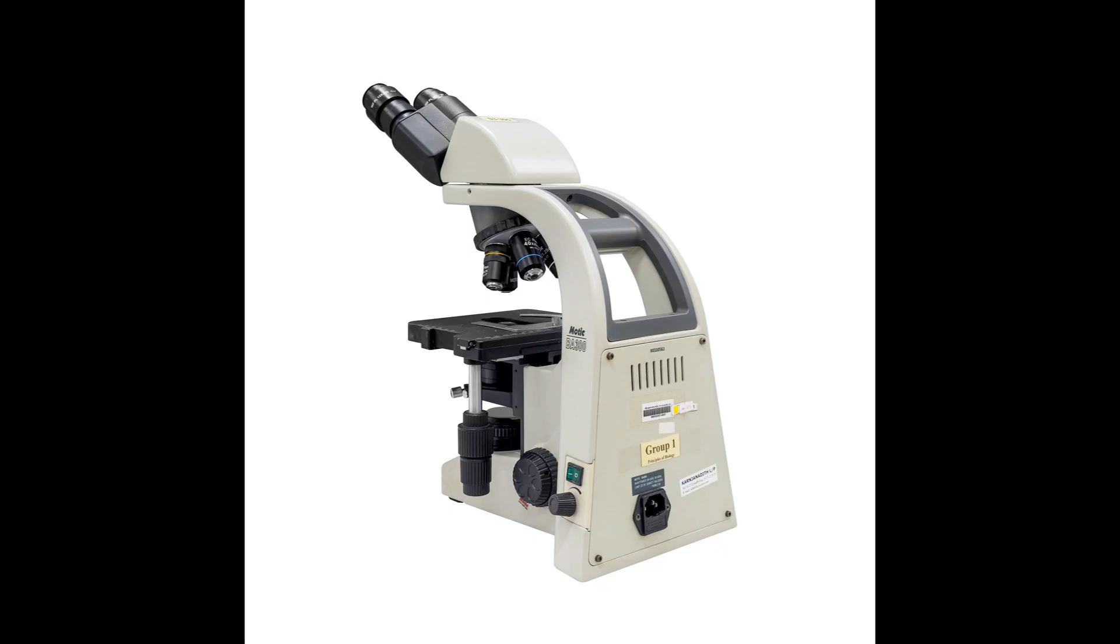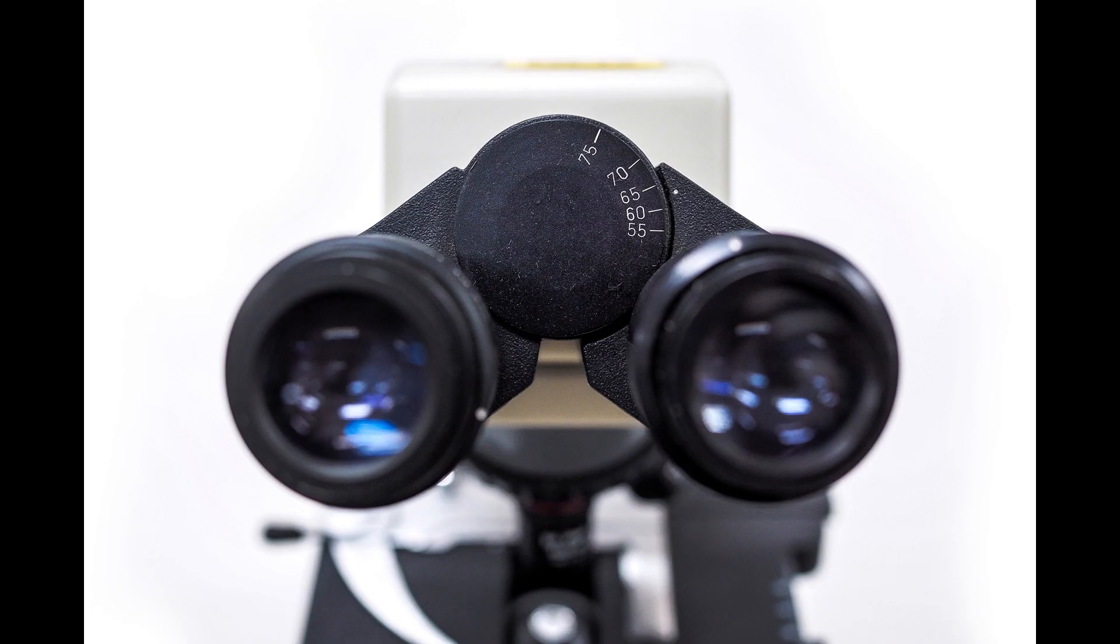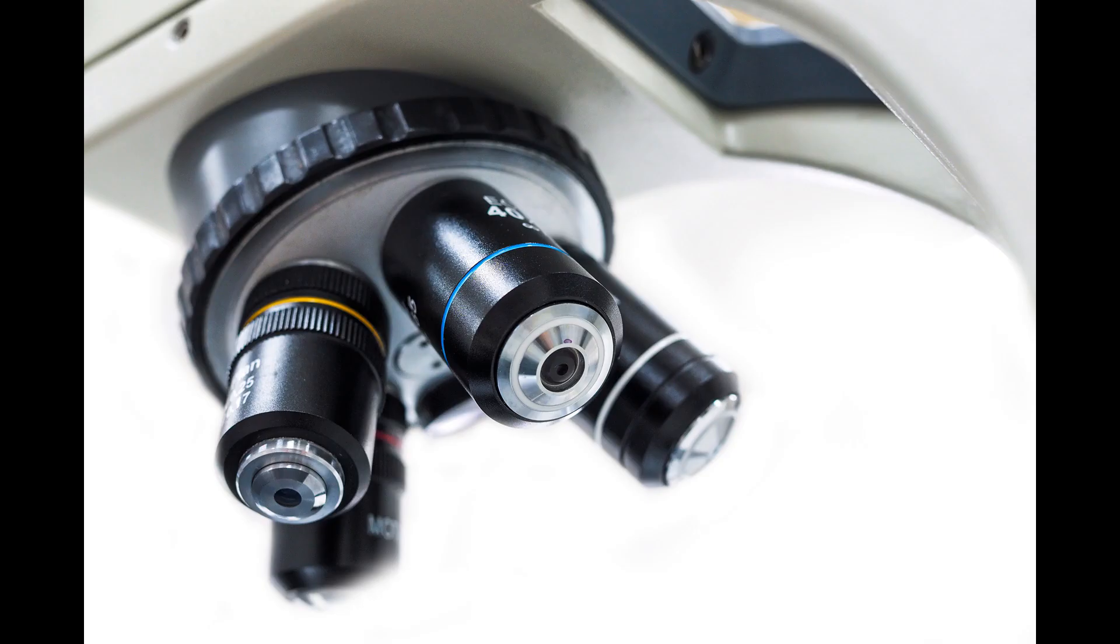The imaging system improves resolution and magnifies the image. It consists of the objective and the eyepiece, or another word, the ocular lenses. The objectives are four lenses mounted on a revolving nose piece. Each objective magnifies the image.